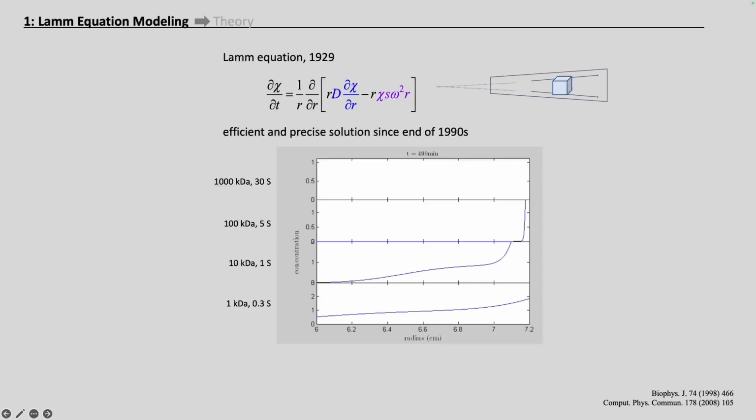You may have seen before in this lecture series how accounting for sedimentation and diffusion fluxes in the sector-shaped cell leads to this master equation of sedimentation velocity. It simply describes the sedimentation patterns of different size molecules.